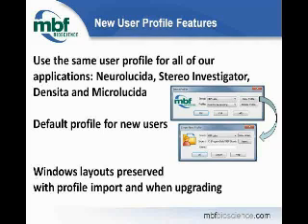We also have introduced a default profile, and so what this means is if you manage a core facility, or your lab has many users, you can set up a default profile that contains the basics. It contains the right hardware configurations and some of the basic needs that you may have for a particular task. And that will be the default when you select a new profile. It will automatically provide an import location for a default initialization file.